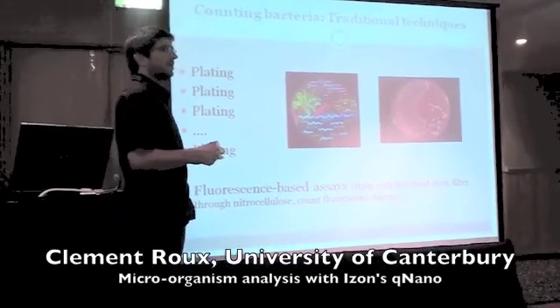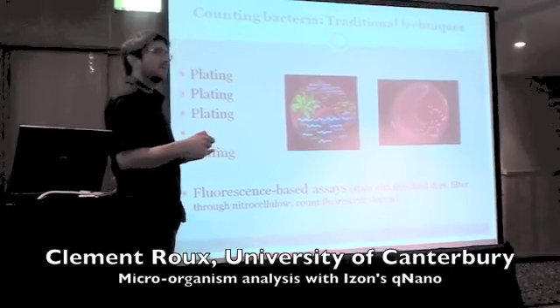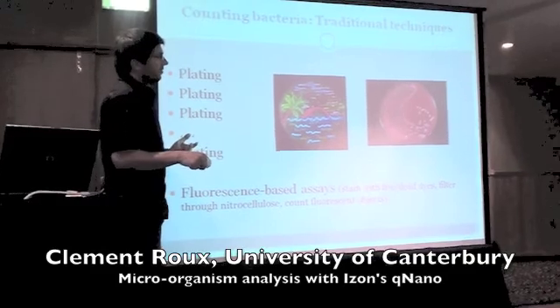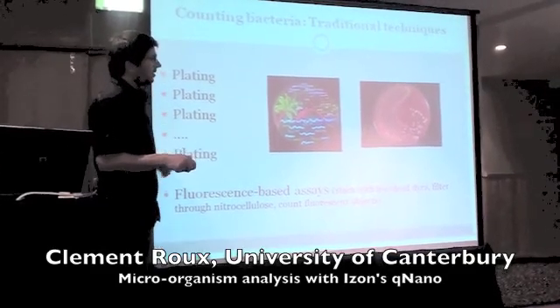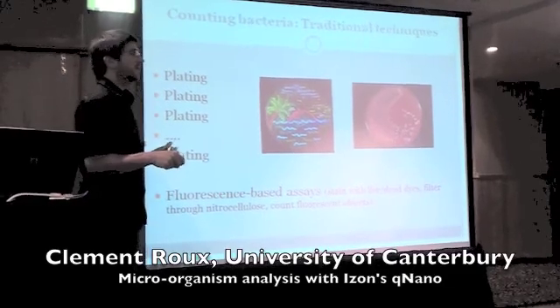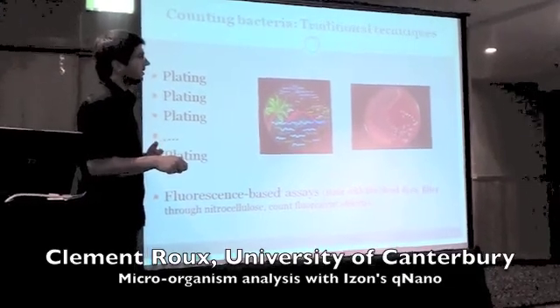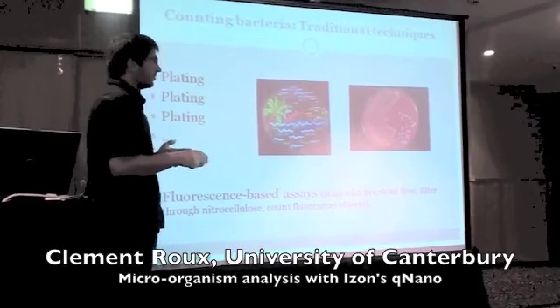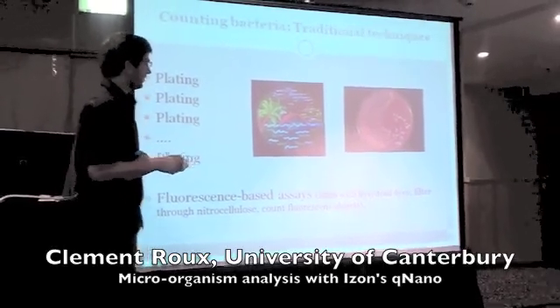This is what people do to count bacteria. They dilute and dilute their samples until they can plate them on agar, and then once you've reached a high enough dilution, you can actually count after a day of incubation. It's very long, a day. You can count colonies, and you count them by eye. And you sit there on top of your plate and you count them one by one, and it takes forever.